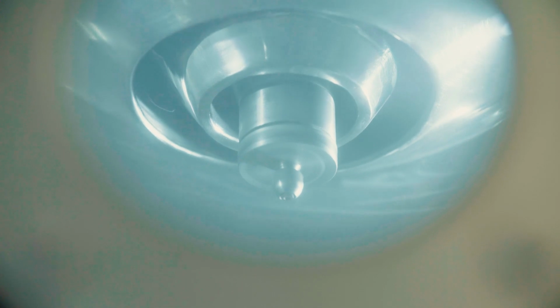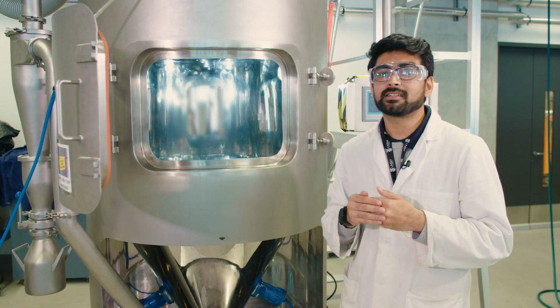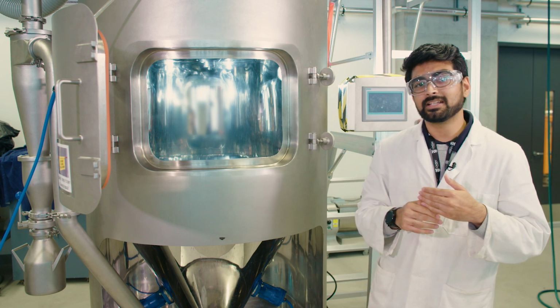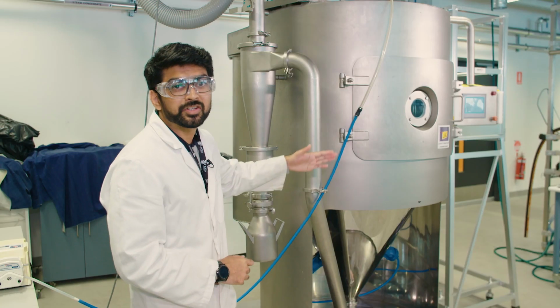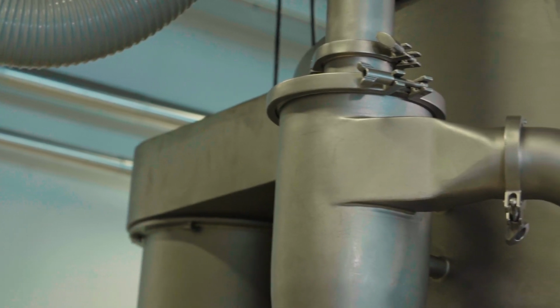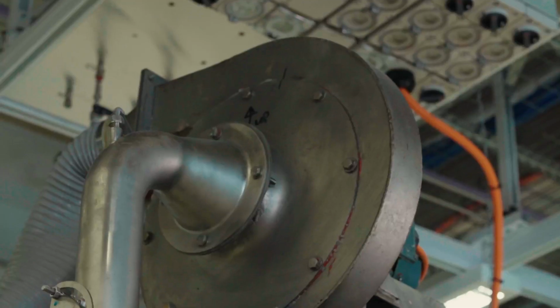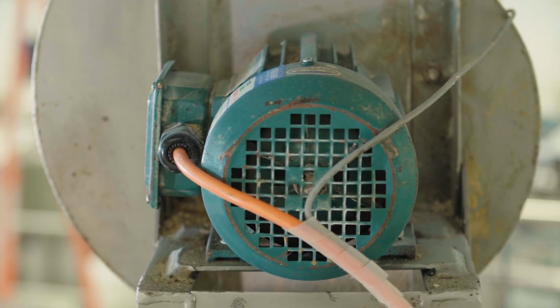The main importance of the concurrent flow is that the heated particles in the liquid form are in contact with the highest temperature, while the powder form is in contact with the lowest temperature. Once the particles are formed in the drying chamber, they move towards the cyclone, where they get separated from the air and pass towards the powder collector, while the residual air gets sucked off by the exhaust and gets out of the spray dryer.